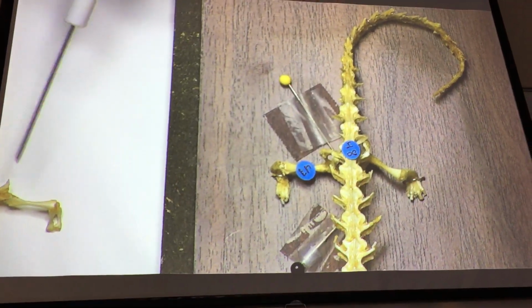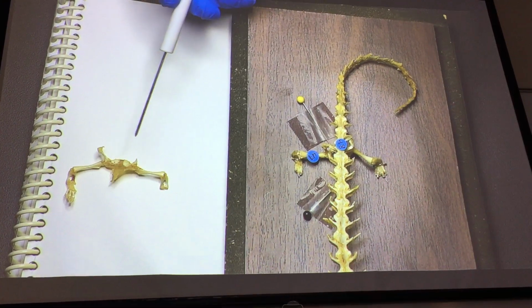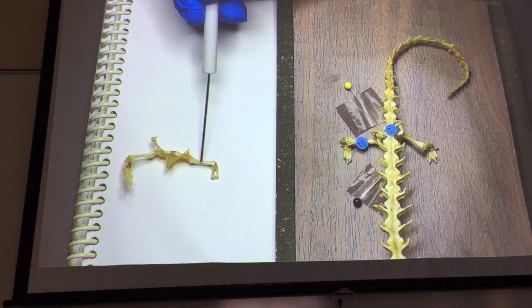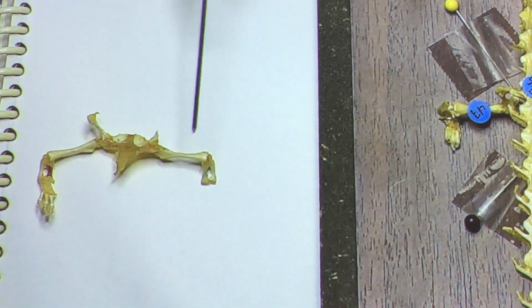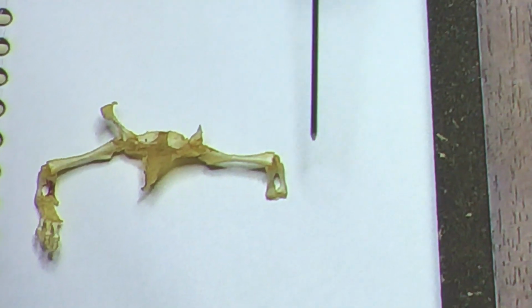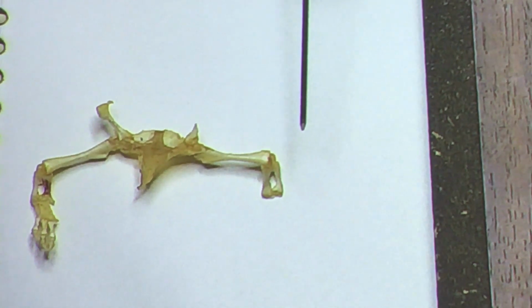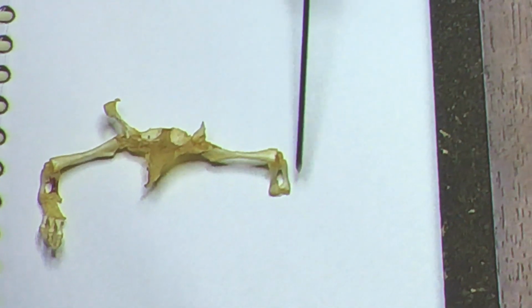All right? All right, and again, you can see part of that here. You can again see where some of it was damaged by previous students. And then everything else is pretty straightforward. The thigh bone on our mud puppy, femur. What is a little hard is telling fibula from tibia. Because unlike mammals that have a big difference in size, they're not that different, are they?